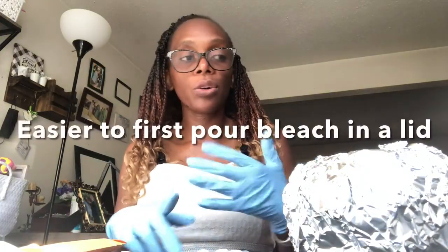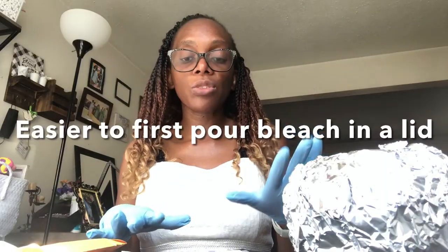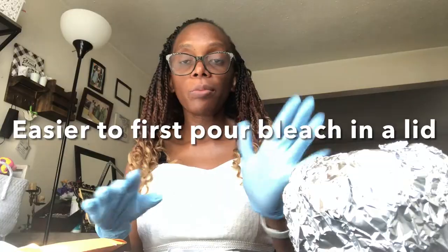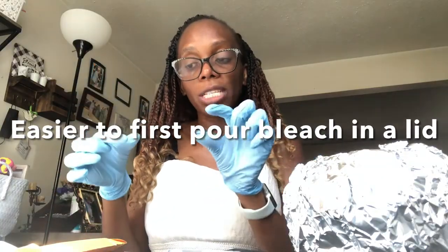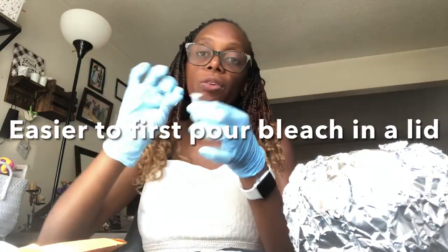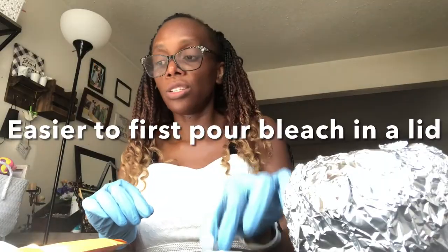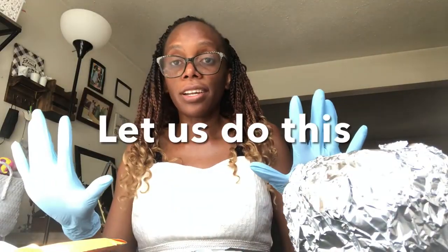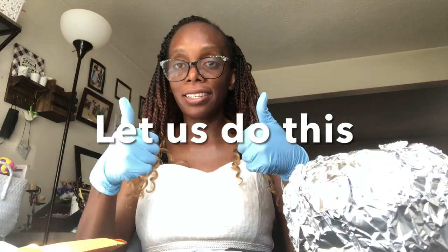And yeah, so I have mine. The easiest thing to do is, because you only need a little to add in one of these tubes, get your household bleach, put it on a lid or a small Tupperware, then it's easy to pour it into one of these tubes. Okay, so let's get started and let's do this.